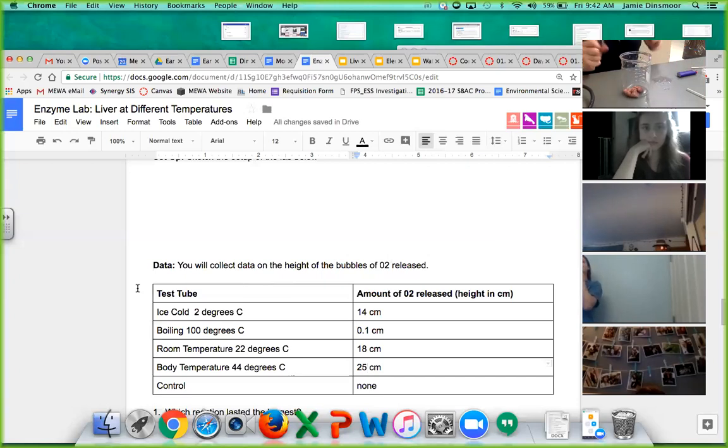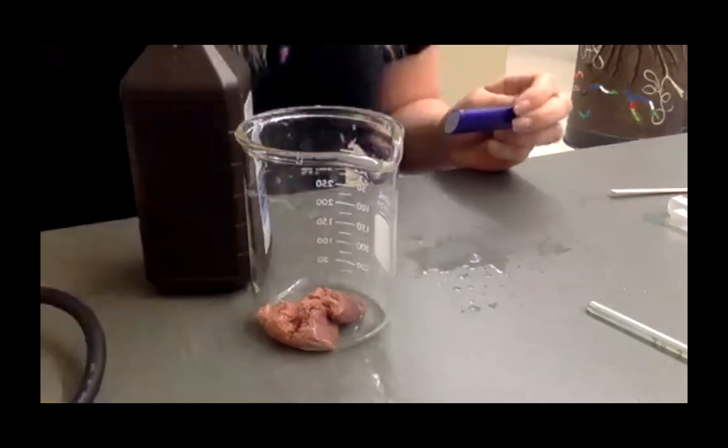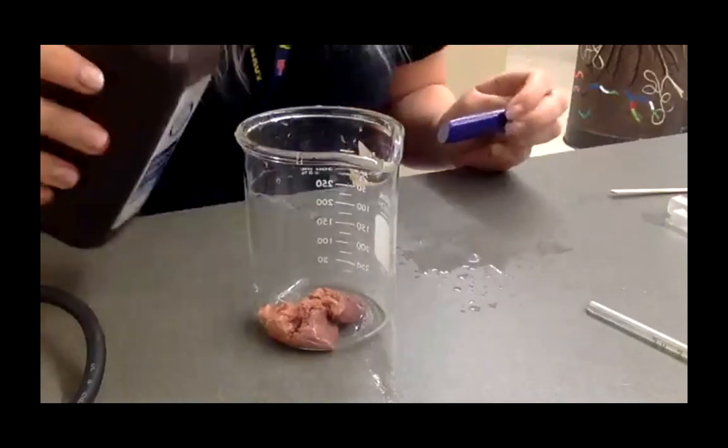Okay, so we're going to take our wooden stick, and we're going to get an ember going while the reaction is going, which is where this gets complex. And in fact, I'm going to stop sharing the screen so you guys can see this in big motion picture.